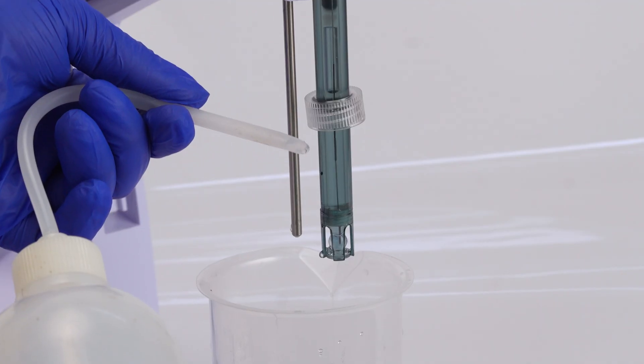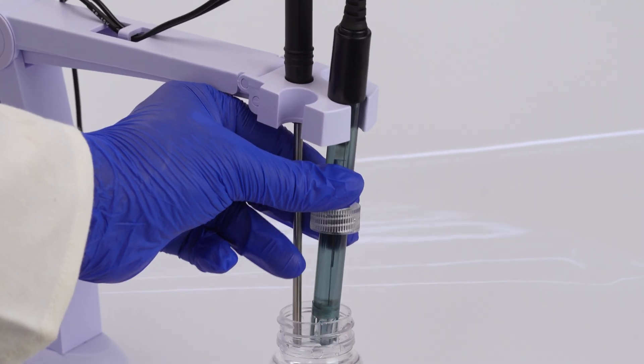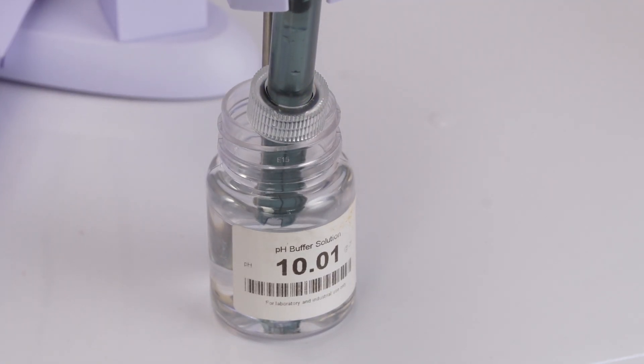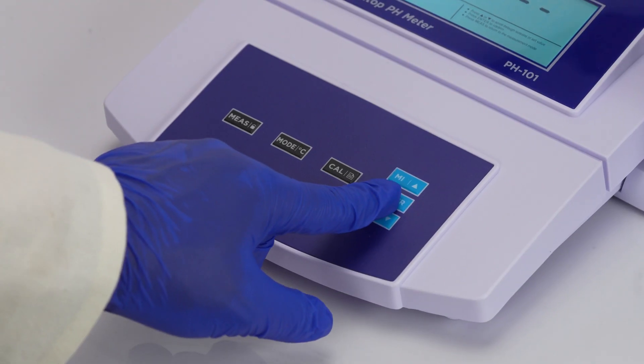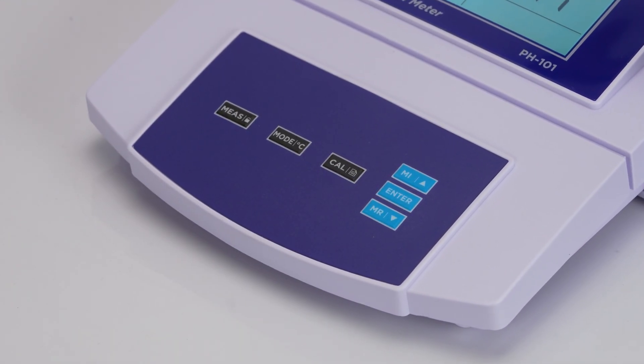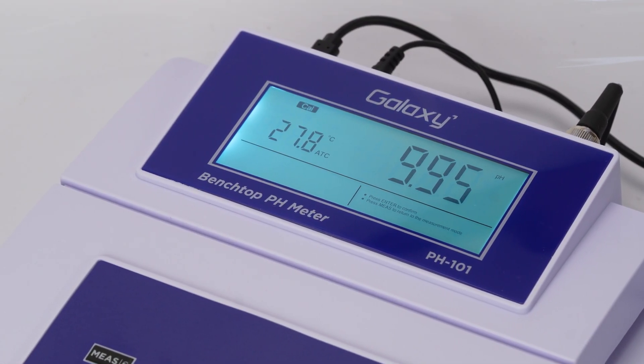For cal 3, rinse the electrode, immerse the electrode in the third buffer pH 10.01, and press enter again. The display will confirm calibration complete.